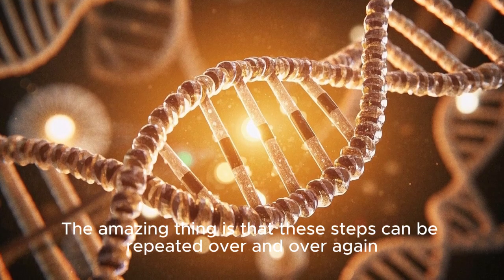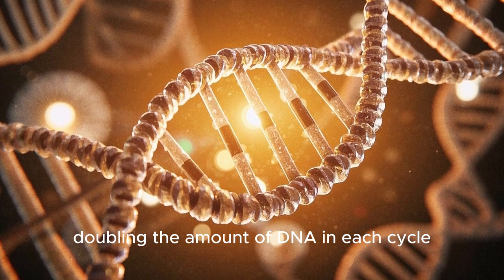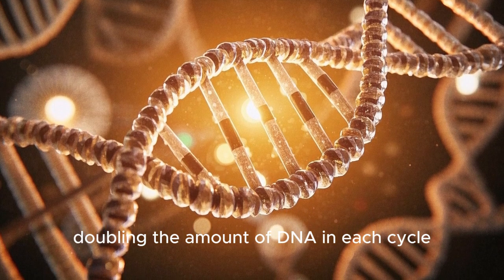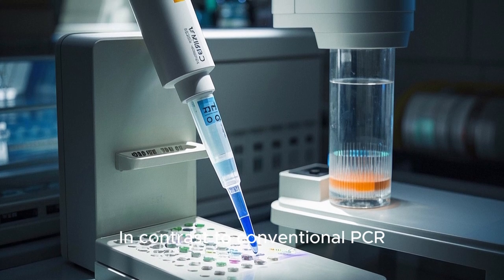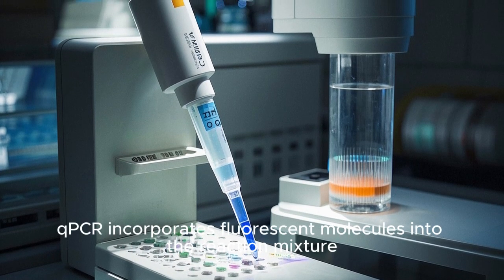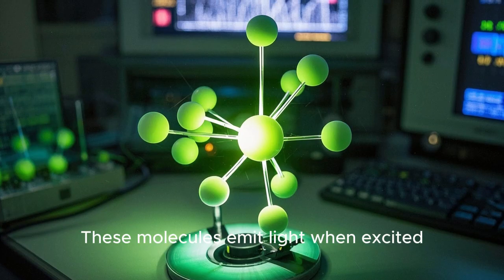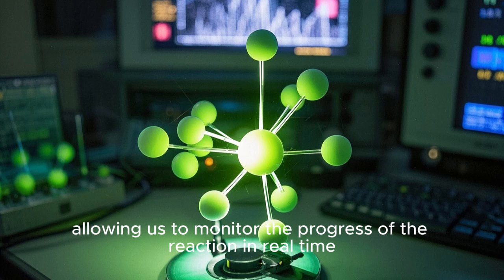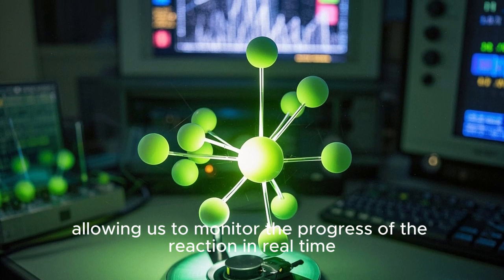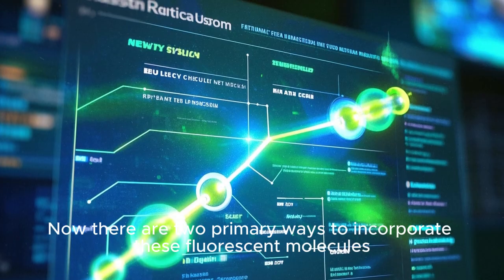The amazing thing is that these steps can be repeated over and over again, doubling the amount of DNA in each cycle. But here's where qPCR shines. In contrast to conventional PCR, qPCR incorporates fluorescent molecules into the reaction mixture. These molecules emit light when excited, allowing us to monitor the progress of the reaction in real time. Now, there are two primary ways to incorporate these fluorescent molecules.